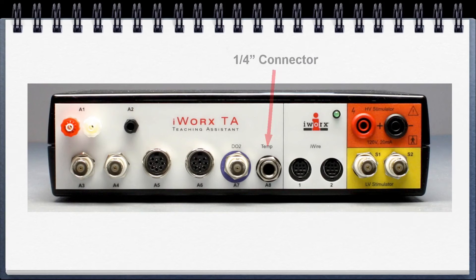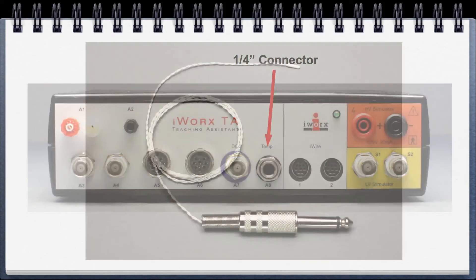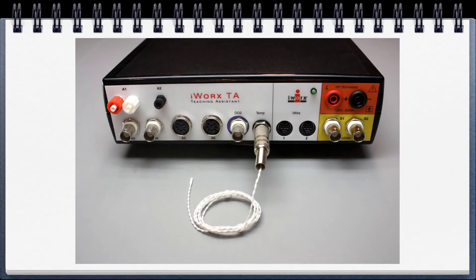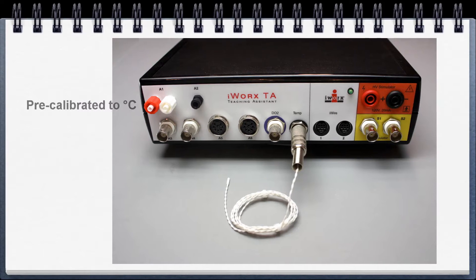Going over to the quarter-inch connector — this is for the temperature sensor. This is how it plugs in, and if you're using the settings files, it is already pre-calibrated to degrees centigrade.